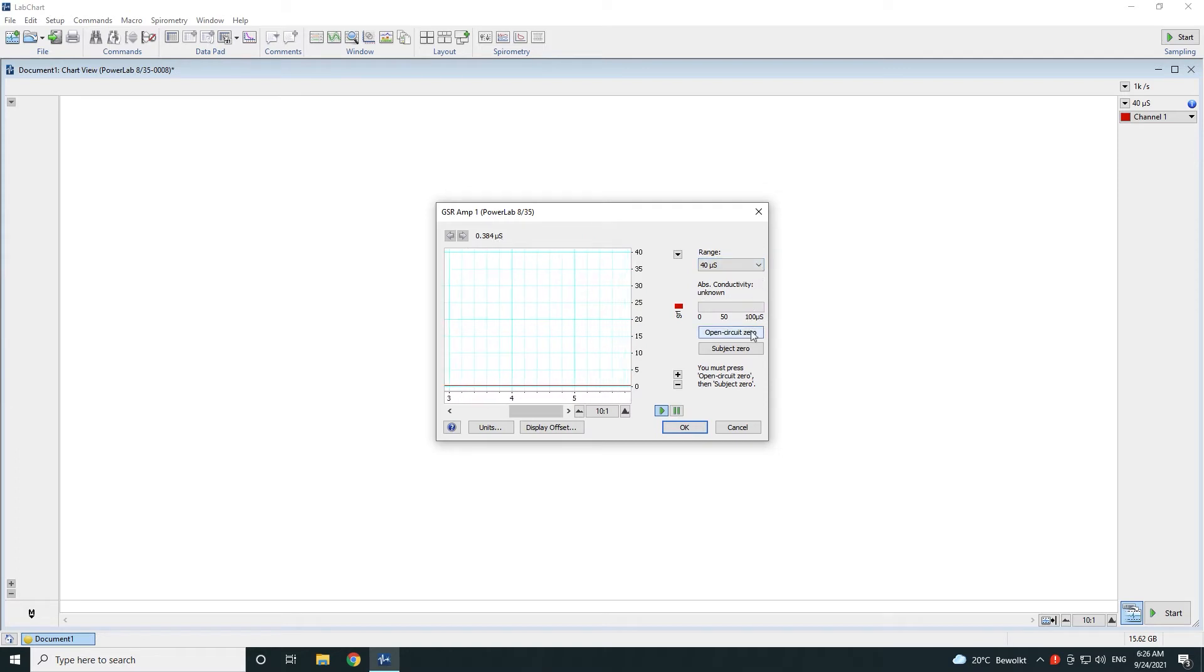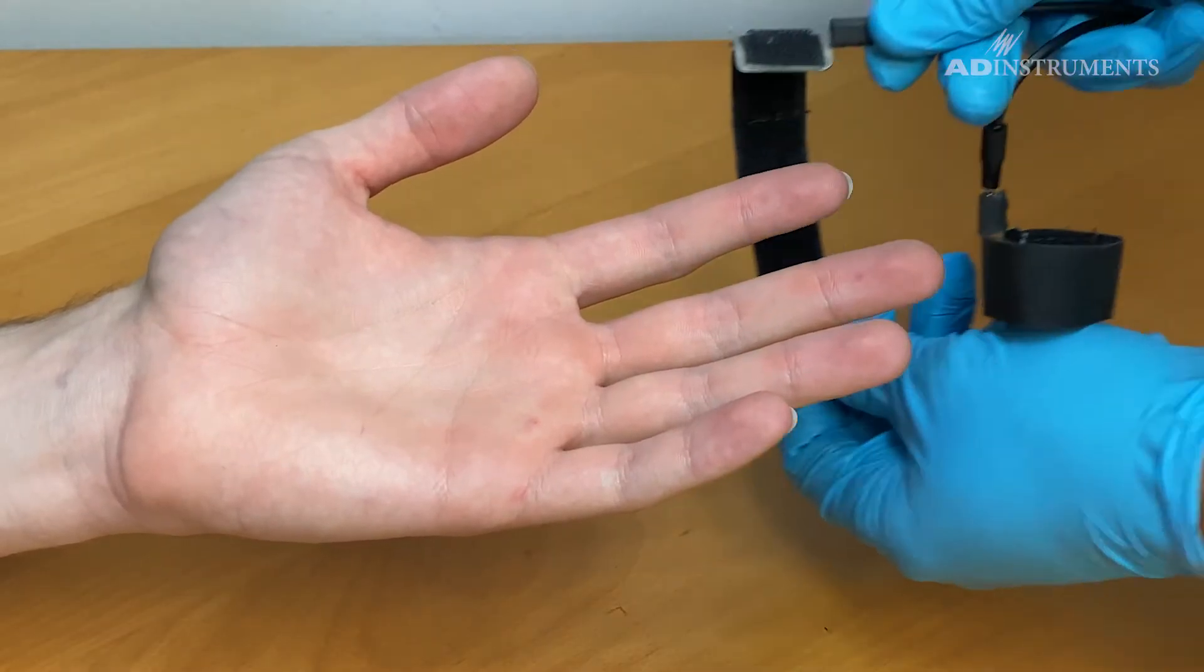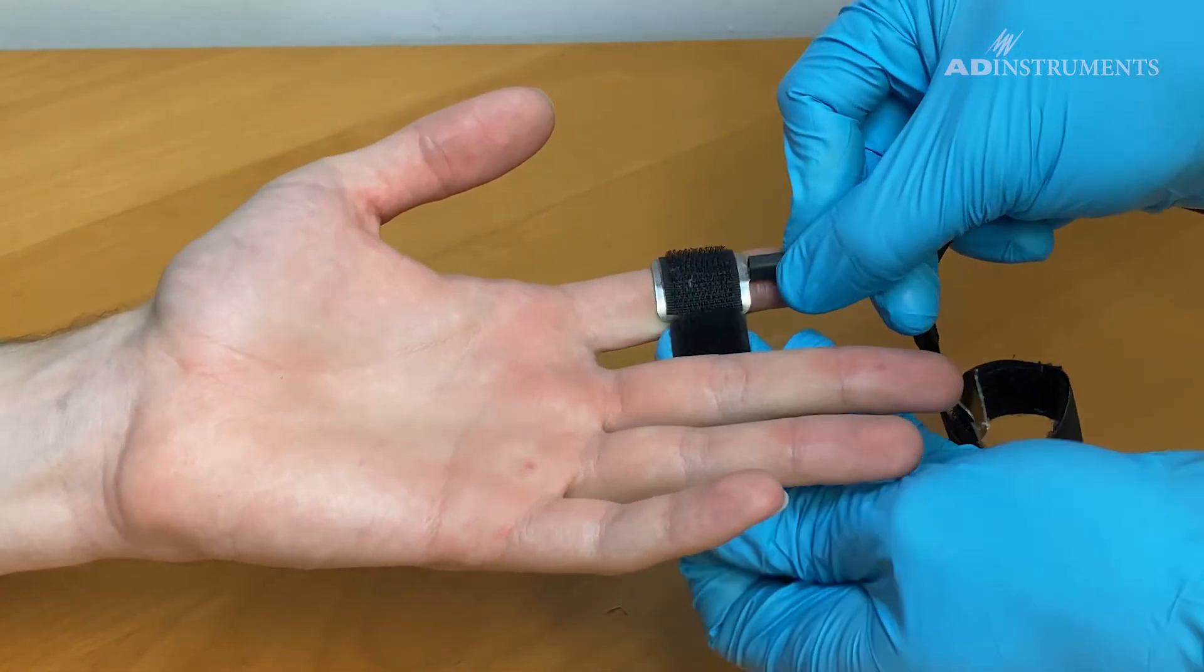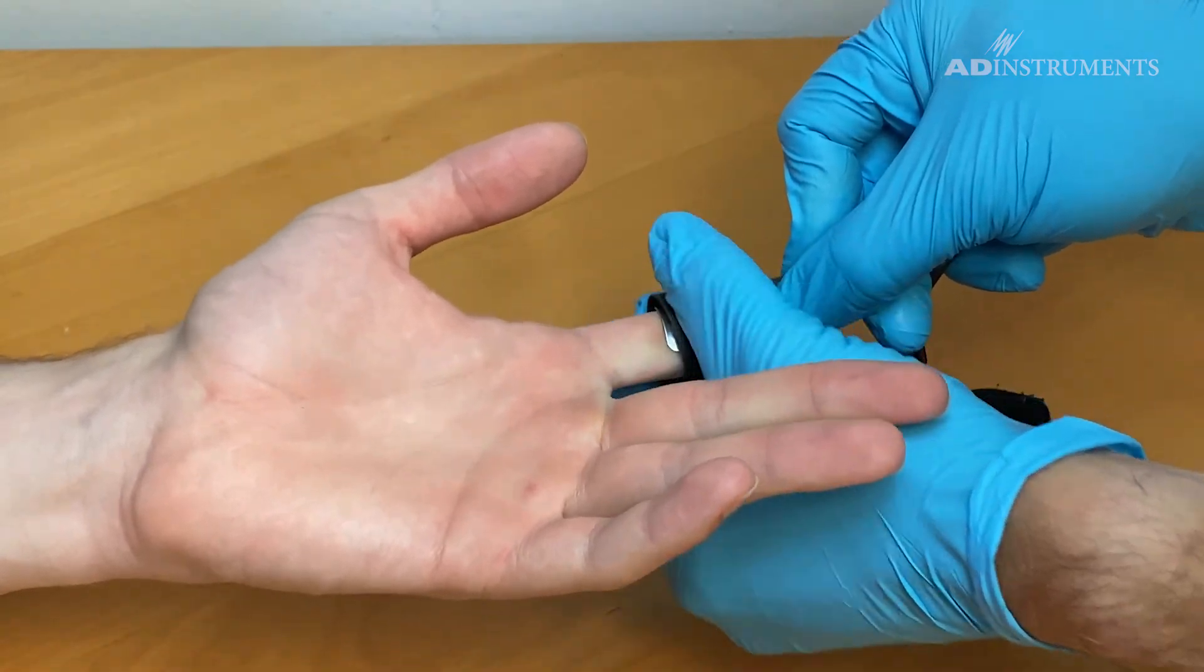Before placing the electrodes on the subject's fingers, click on open circuit zero. Place the electrodes on the forefinger and ring finger to remove any chance of contact between the electrodes.